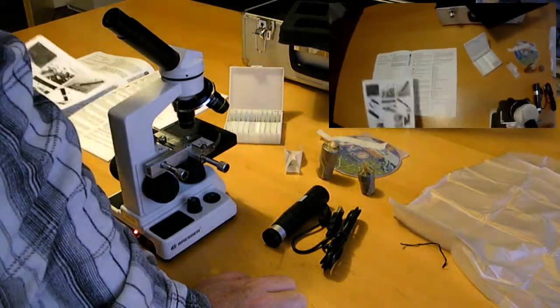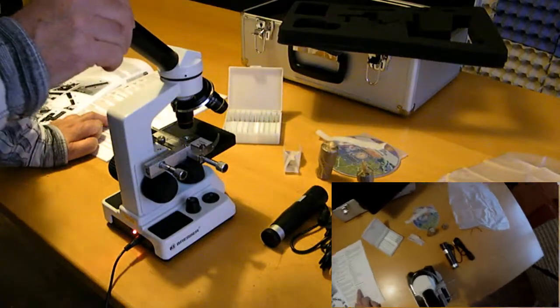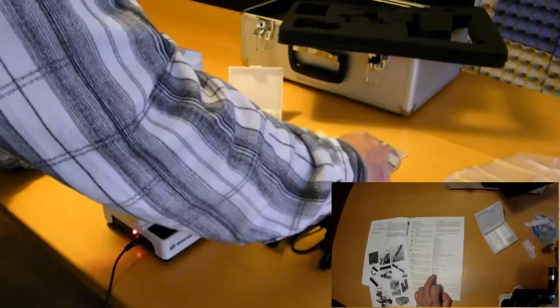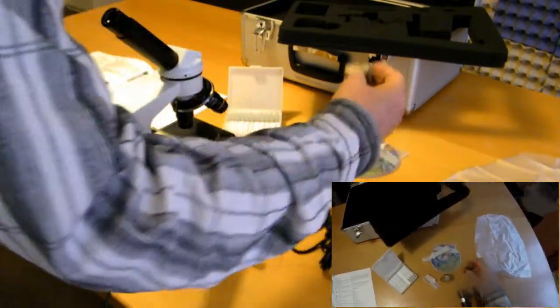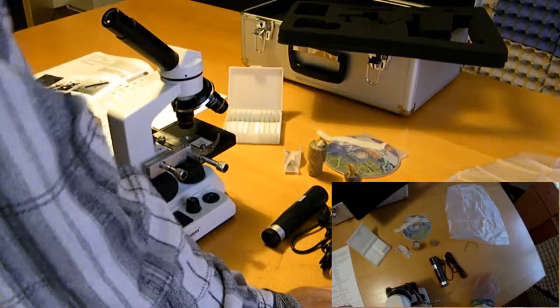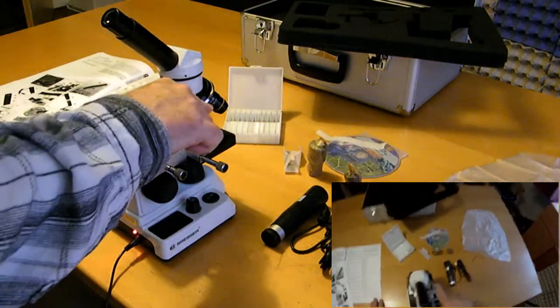So now we don't know everything. The eyepieces, what kind of eyepieces do we have? We have a 10 times eyepiece. We have 5 times and 16 times. I think that is the 5, the bigger one, and the 16 times, factor of 16, this one. And the software. I would recommend installing the computer software now so that you can have the view through the microscope.